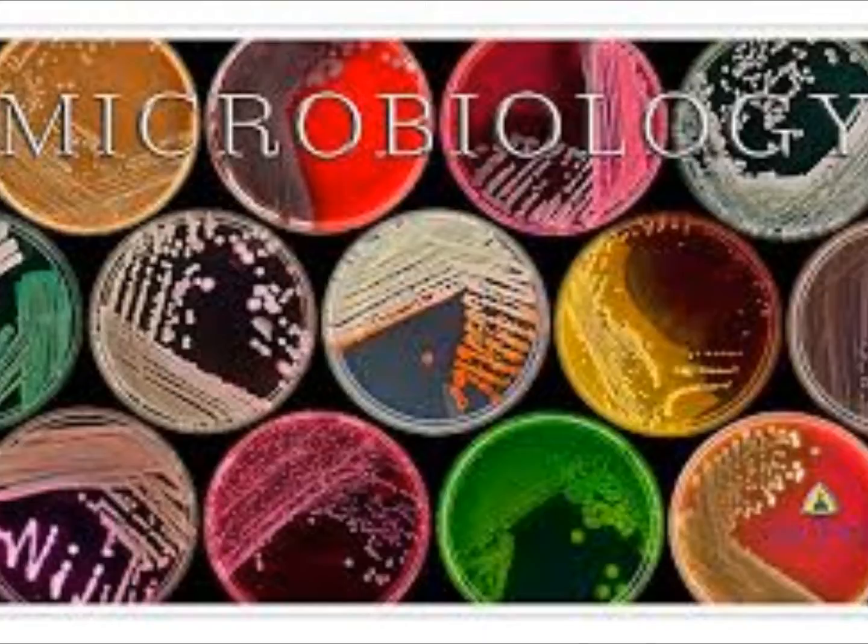And so these characteristics, I did give you a second sheet, and there's one in your book, your syllabus too. The characteristics of each colony type are very helpful in guiding us in a direction for the identification of the organism. Because some, like Micrococcus luteus, it's always yellow.